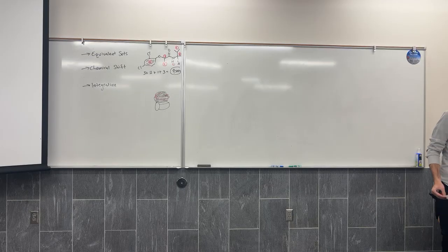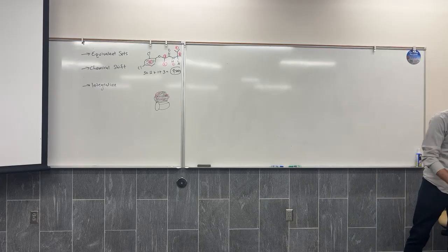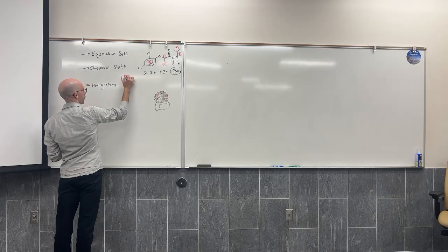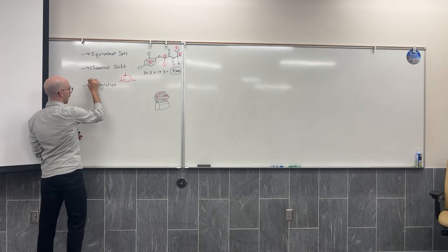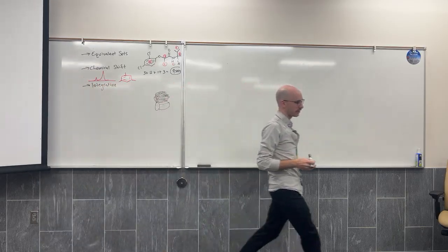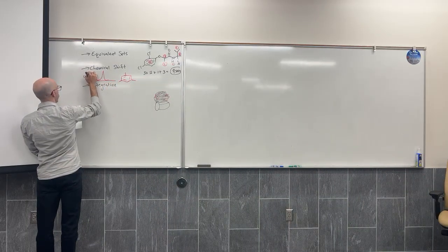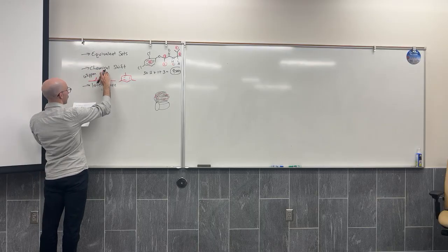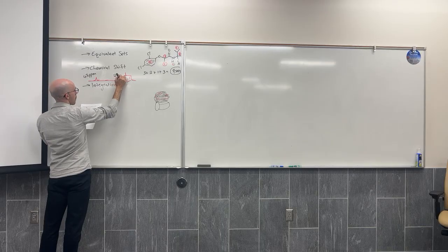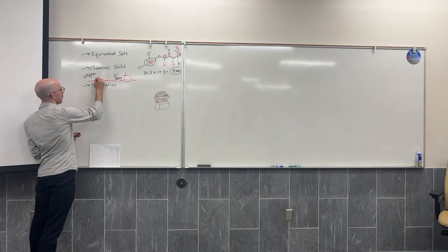Oh, actually, I wanted to remind us about 1,3,5-trimethylbenzene. And I want you guys to tell me which signals are produced by which hydrogens. We've got this signal to the left that's around 6.8. And we have this signal to the right. I mean, I drew that really close to each other. We've got a signal to the right that's around 2.1. Which hydrogens are producing these signals?